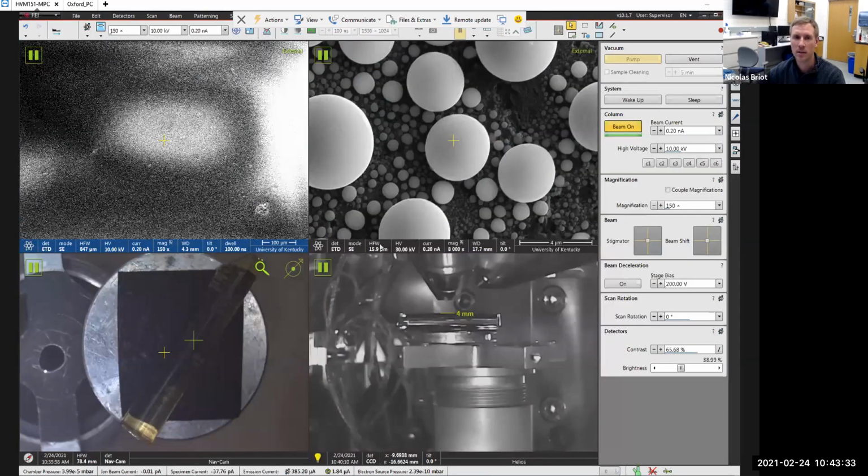We're not going, we're going a micron in, maybe something like this. So when you cut and you embed and you polish, the first few microns are disturbed. Yeah, if the silver was penetrating maybe 10 microns in, 15 microns in, we should be able to see that. If it's within the first 5 microns, we might not be able to see that.